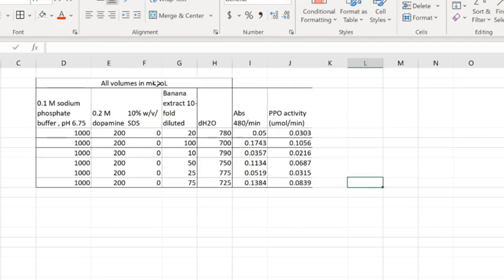To make the final plot, I think I'll prefer milliliter because if I get a slope where the banana volume extract is on the x-axis, if I divide by a smaller number, I'll get higher numbers in the end, or with less leading zeros.